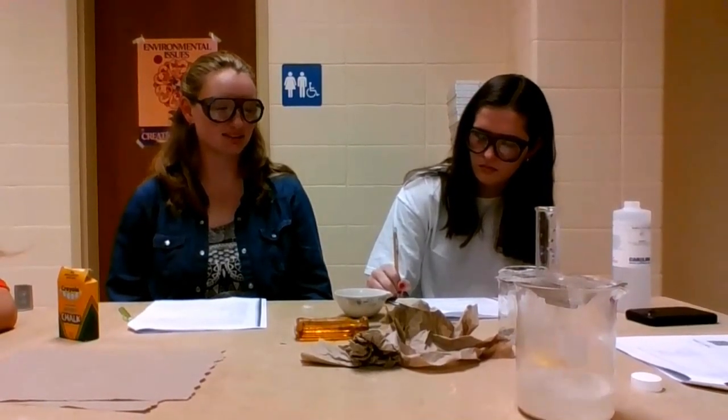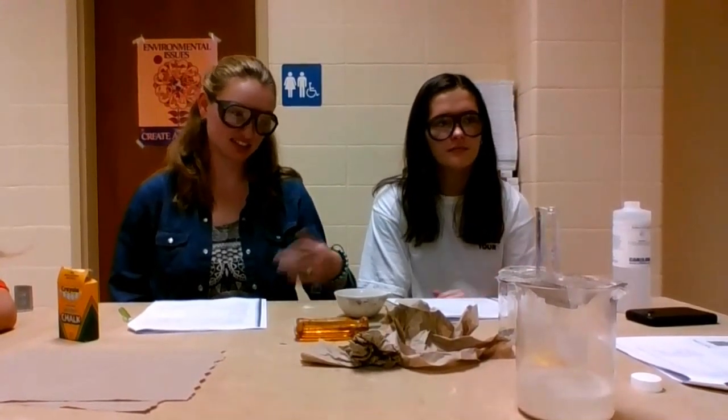The zinc does nothing. Wow. That was exciting. Maybe it's just doing things very slowly. I'm thinking it's doing nothing. Cool. That's just an excuse to be lazy, Zinc.